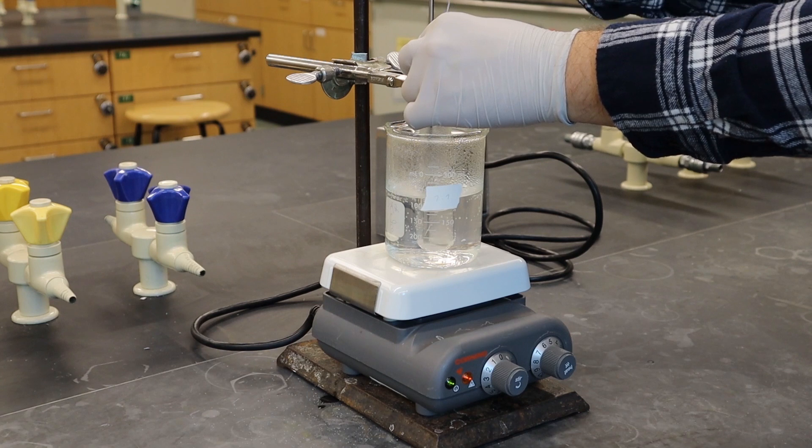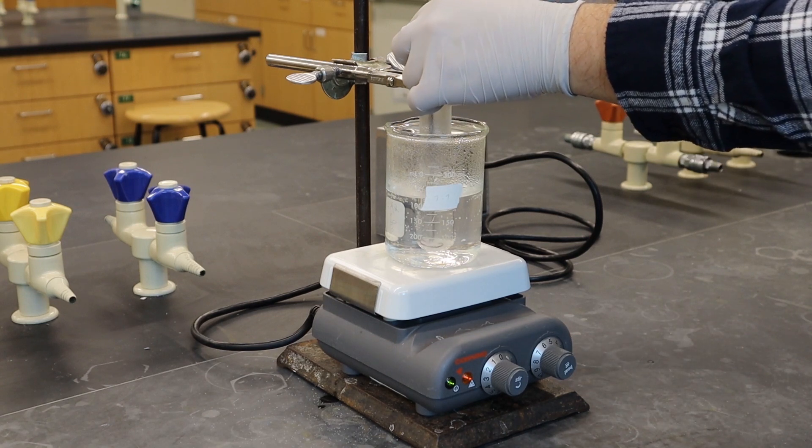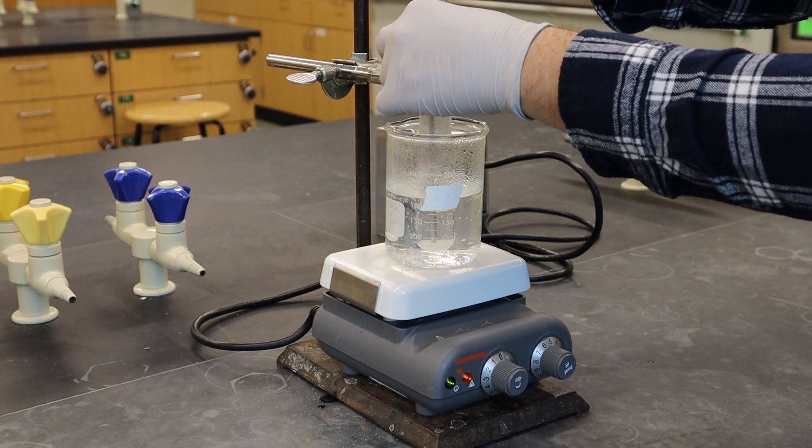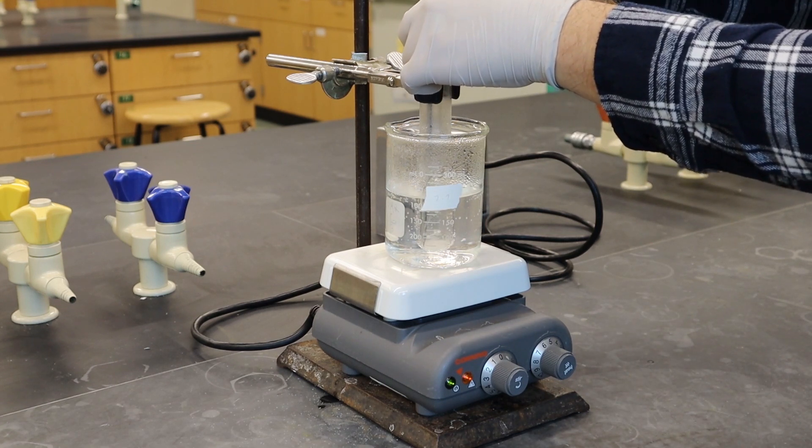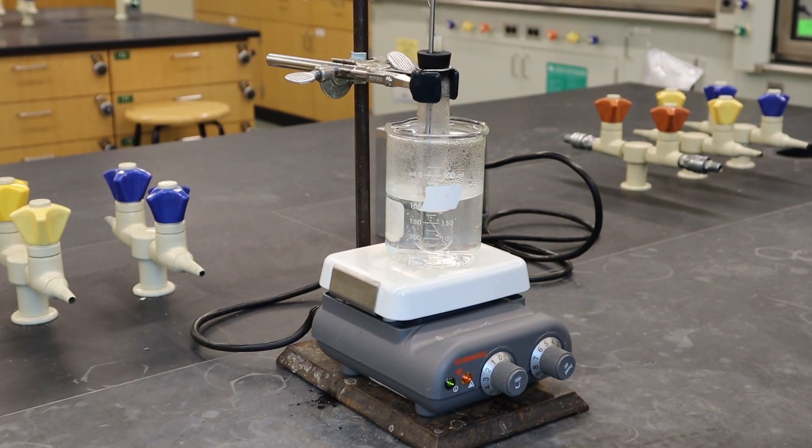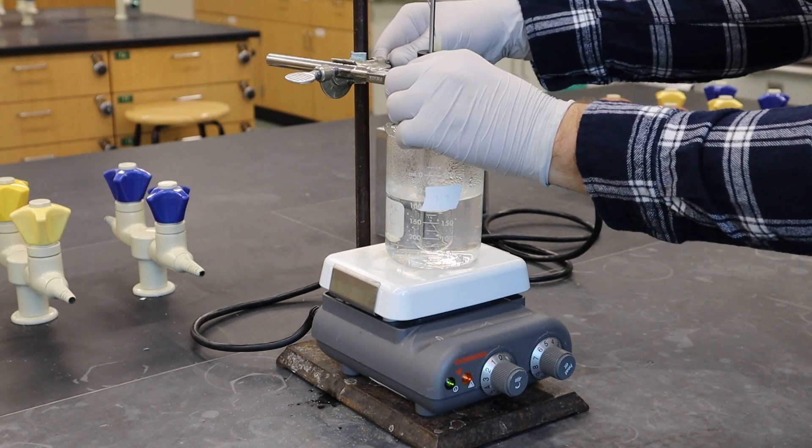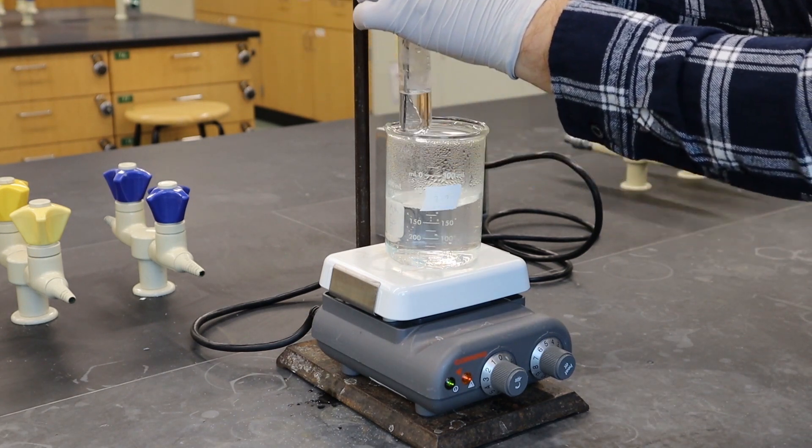So as you're doing this you would be measuring out the temperature at which the solid reformed back into the solution. So we're not going to measure when it dissolves but we're going to measure when it stops dissolving. Same thing, it's just a little easier to do it this way.